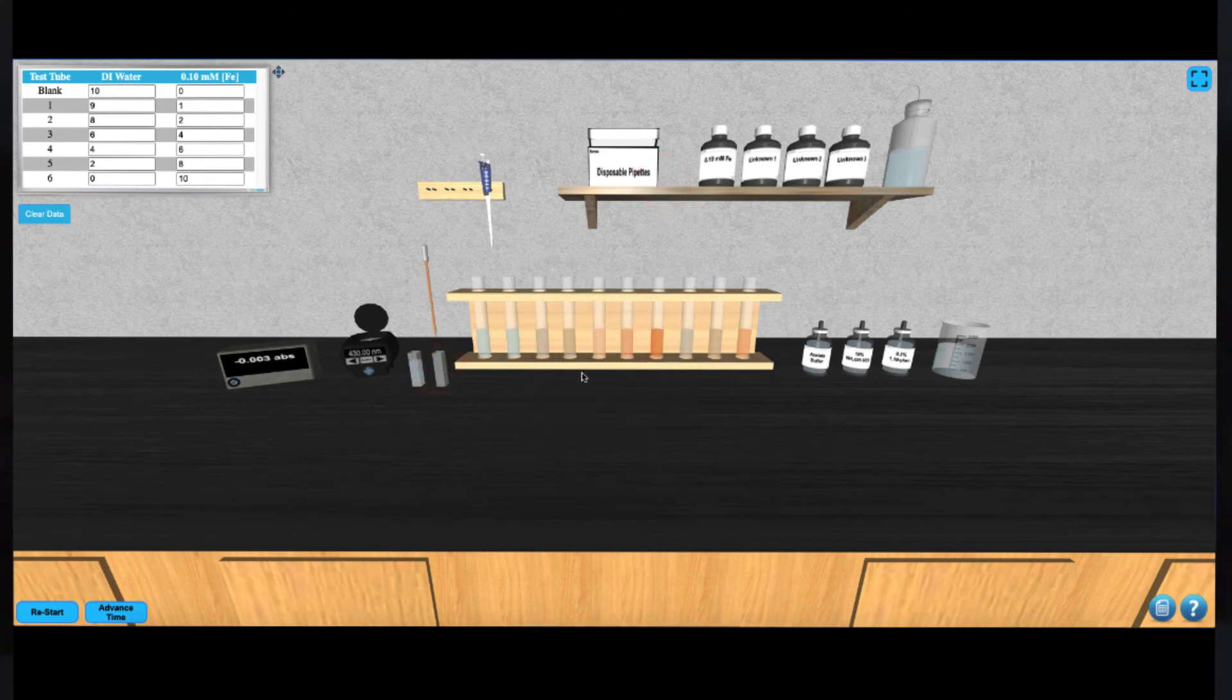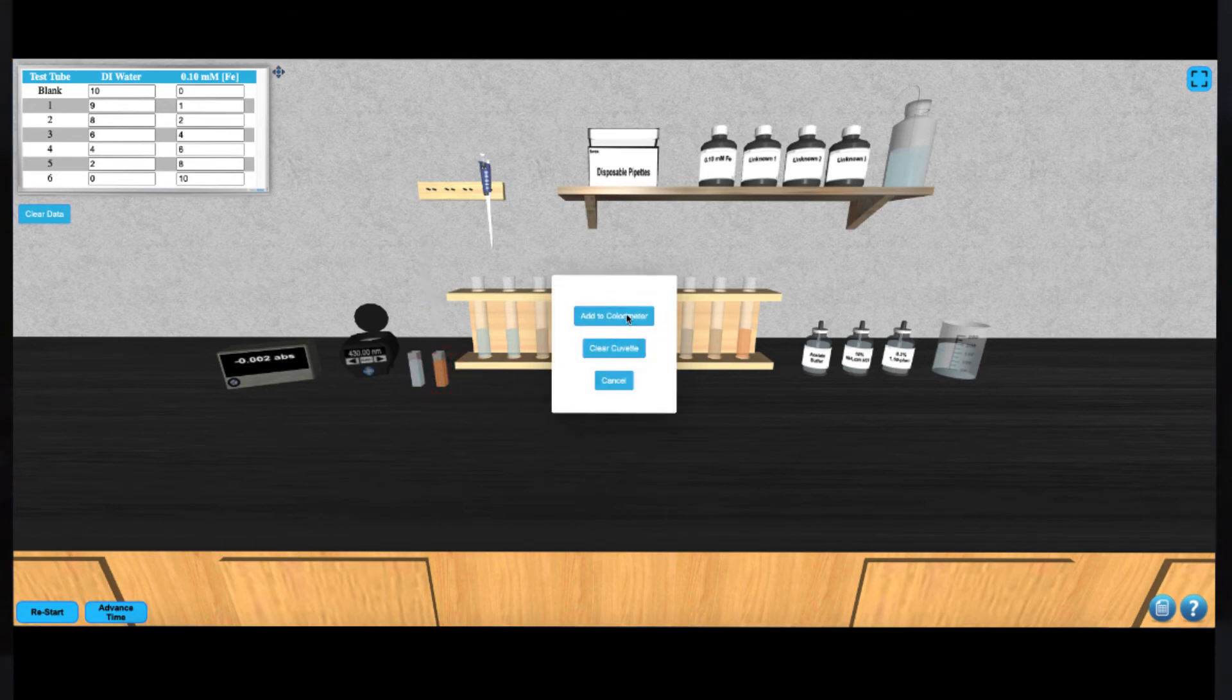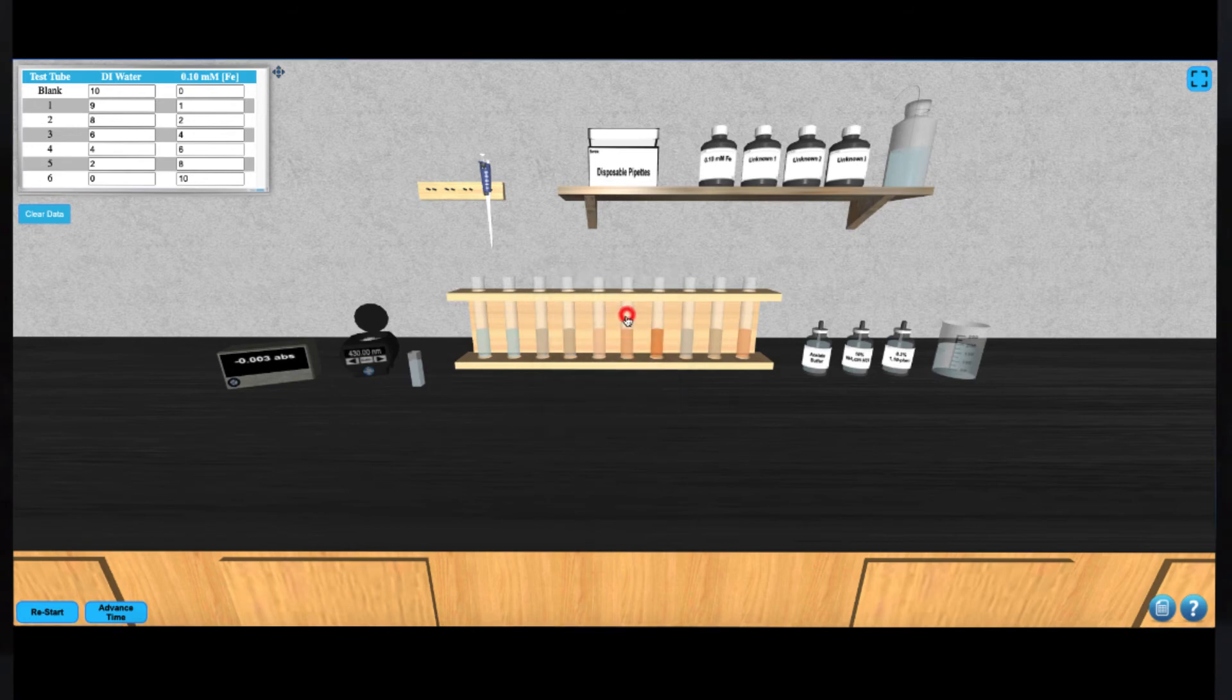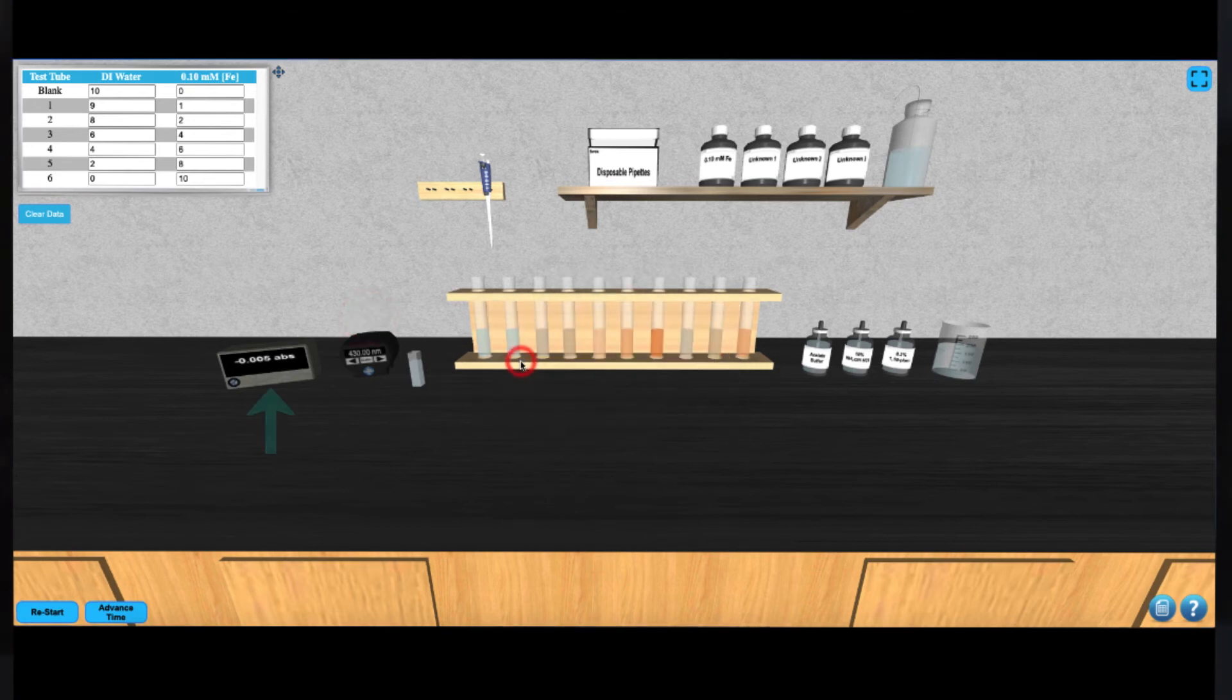Once the solution is in the cuvette, you can place it in the colorimeter by clicking on it. Click the lid of the colorimeter to start the absorbance reading process. Take note of the absorbance on the digital readout next to the colorimeter.